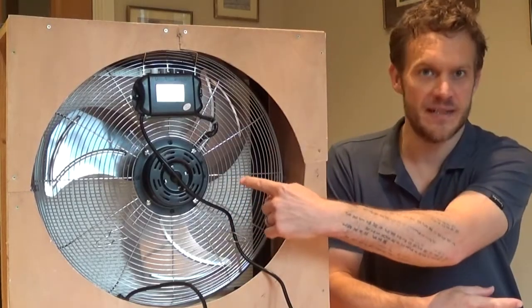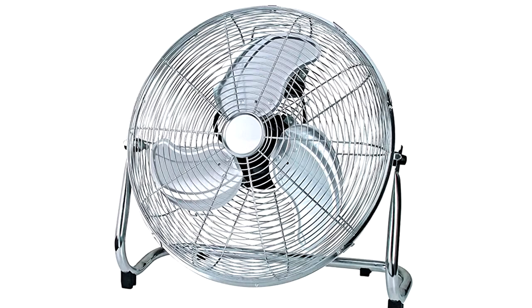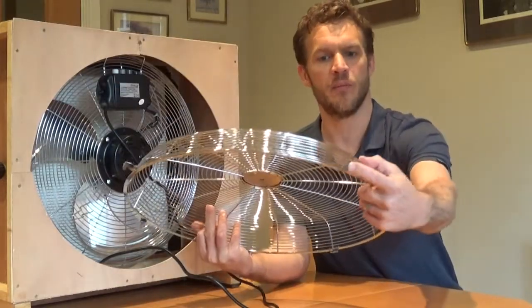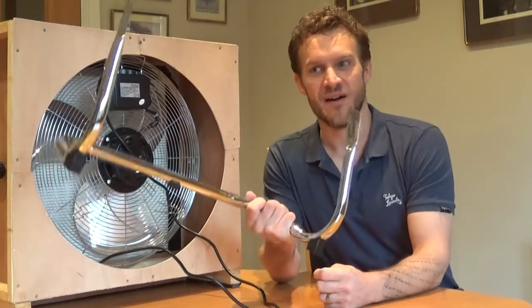First thing is you need a fan. This is the back of the HEPA filter fan and you can see the fan situated in this box here that I've created. It's a pretty standard 18-inch fan that I've taken the front off of. This is the front — I've just taken the front off when I bought it, it just unclips.